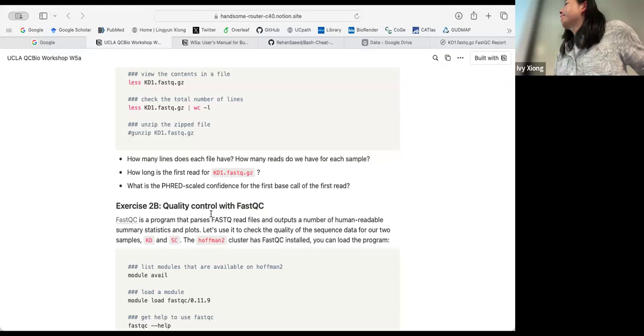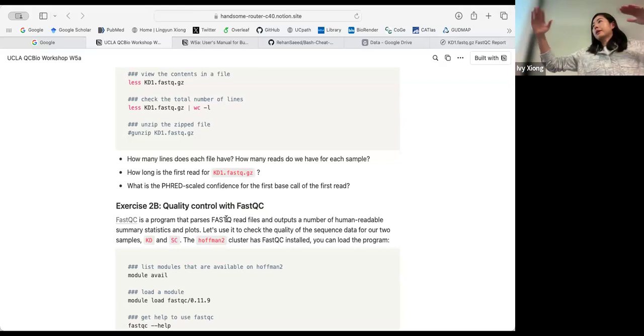Do you get differences in reads with different tissue types? Would you get different efficiency for the sequencing? Yeah, the depth definitely is going to vary, even from sample to sample. But it's not really a big concern if we can make sure that the quality is good enough, because in the end you want to have that quantification. The more reads, of course, give you better coverage.